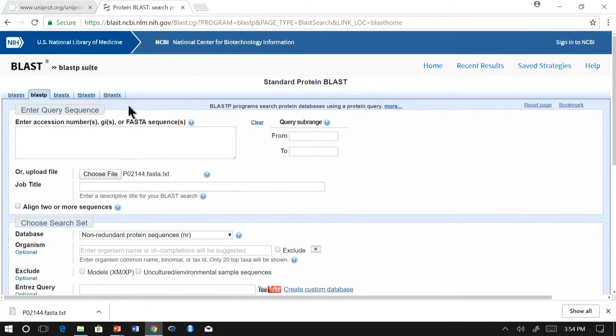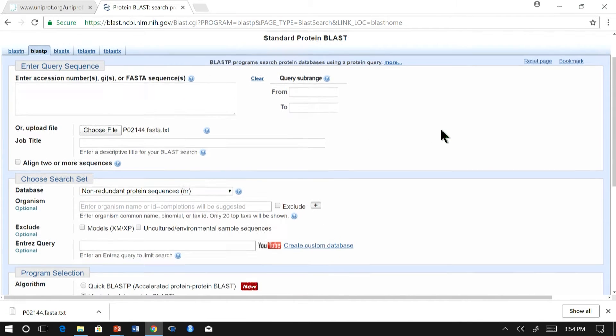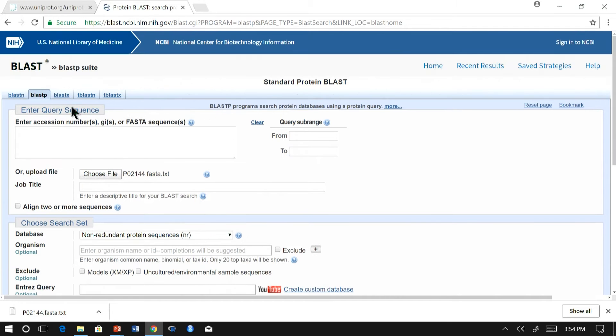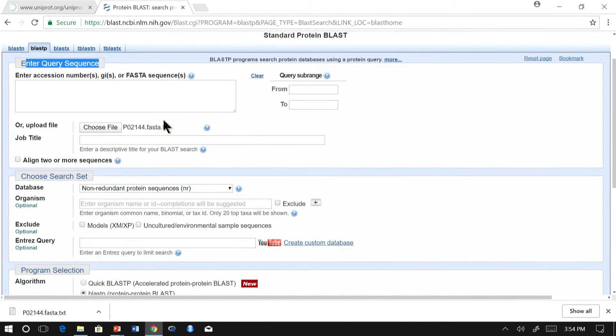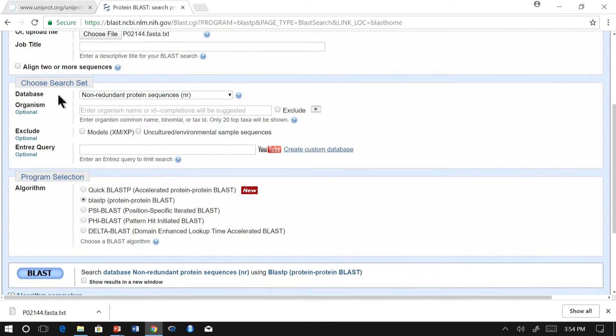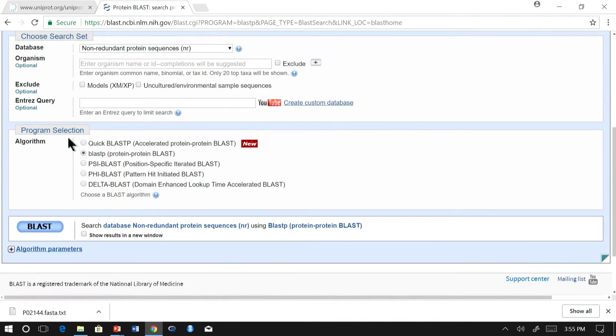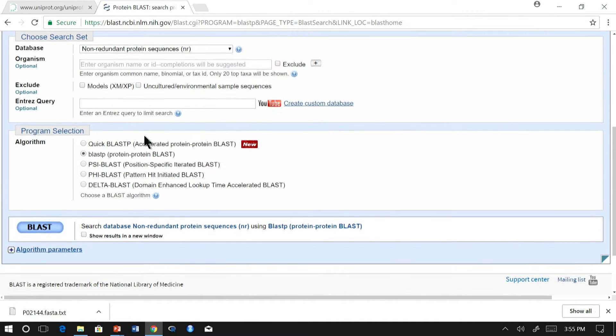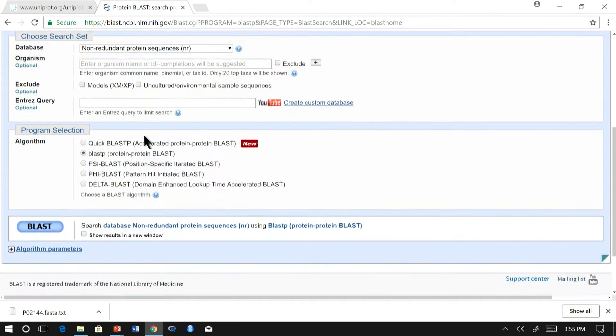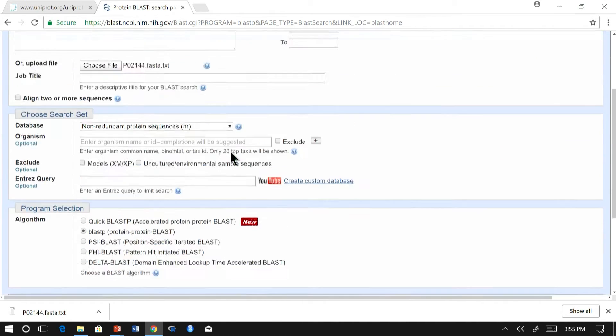If you look at the UI of the BLAST, it is very well organized. The first section contains the query sequence where we have multiple options to enter the query. The second section consists of the database, the target database against which we want to blast. And third section consists of the algorithm which you want to use. Additionally, there is a fourth section, algorithm parameters, which we will discuss later.